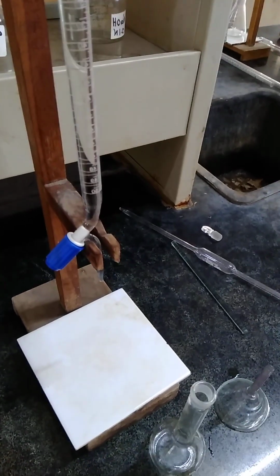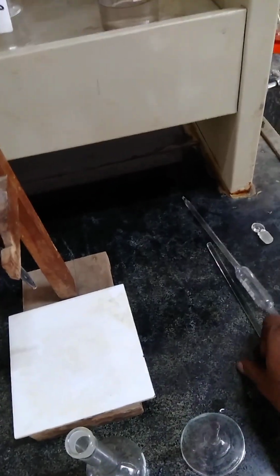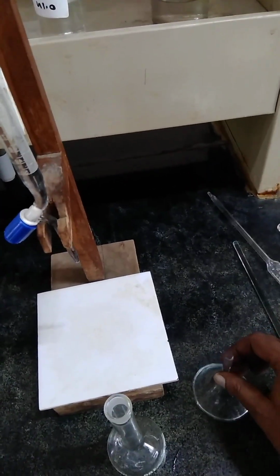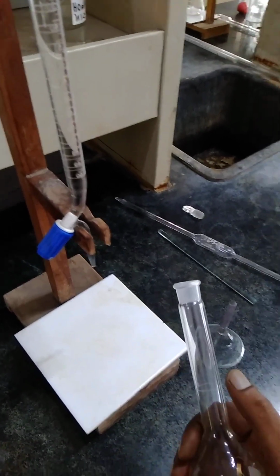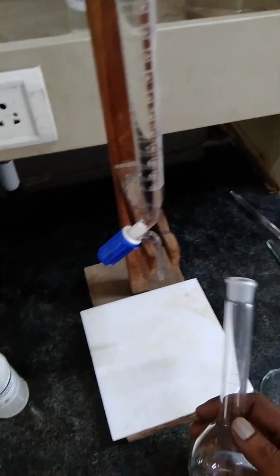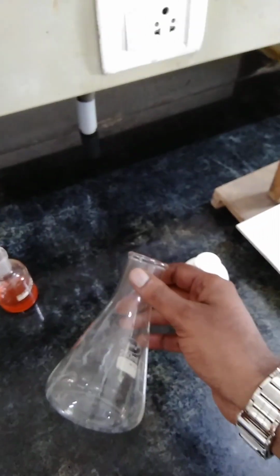So first of all, before starting the demonstration, I want to tell you the names of the apparatus, which you already know because we have experience in the 11th and 12th standard regarding volumetric titration. You will prepare a glass funnel, a standard flask which marks the volume, reagent bottles which are labelled with a number, then a conical flask, then a burette of 50 ml capacity.